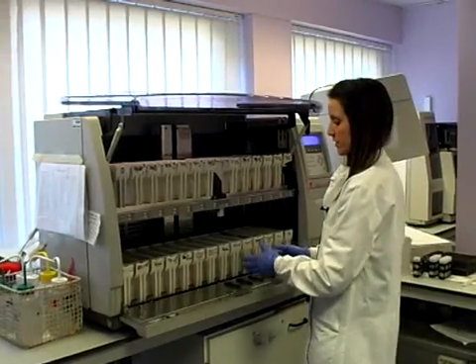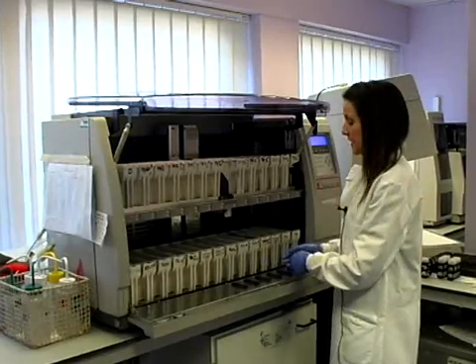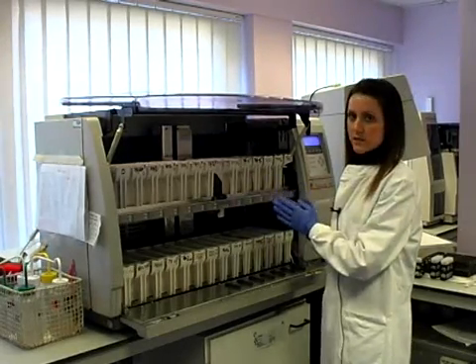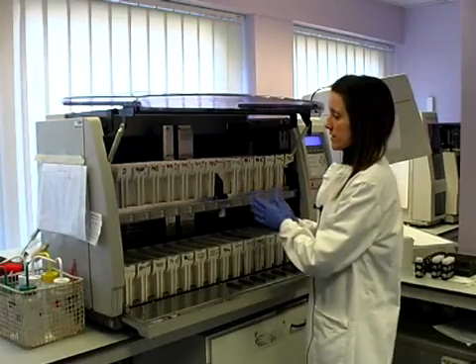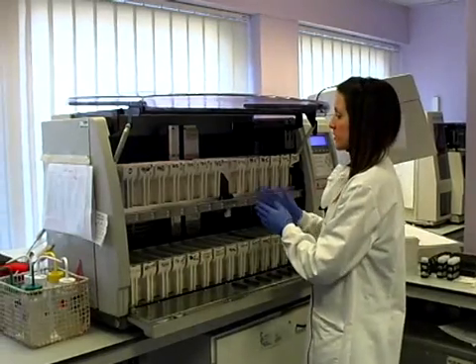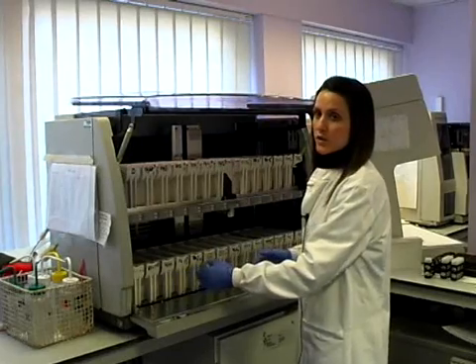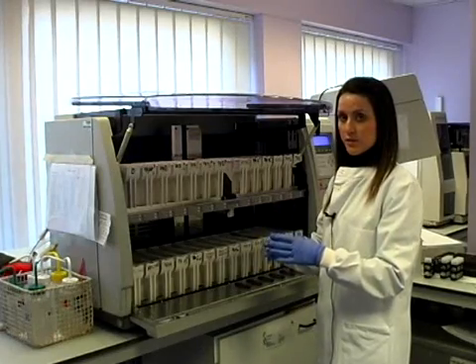The slides go through a series of waters and alcohols. They then go into hematoxylin, which stains the nuclei of the cell. They then move to a stain called OG6, which is orange and highlights cytoplasm and keratin cells. They also go to EA50, another cytoplasmic stain which shows up blues and greens. They then wash through more alcohols and finish up in xylene, the clearing agent, which takes away all the water so the slide is clear to screen.